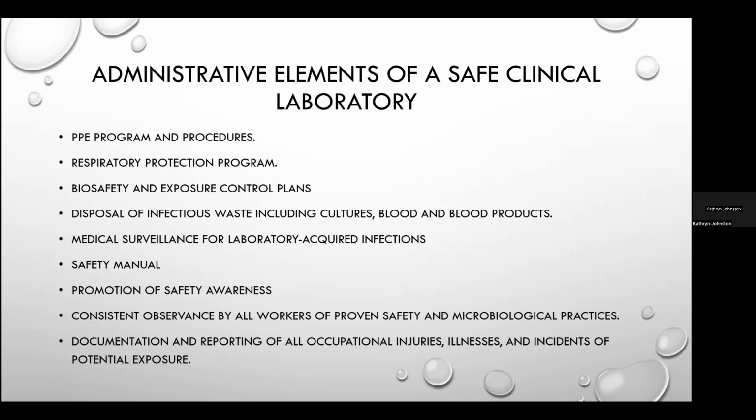There is need for a comprehensive plan for the management and disposal of infectious waste, including blood and blood products, medical surveillance for infections that may result from exposure to agents encountered in performance of routine duties, or when early diagnosis reduces the risk of serious consequences of infection.